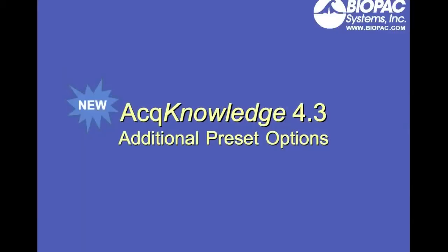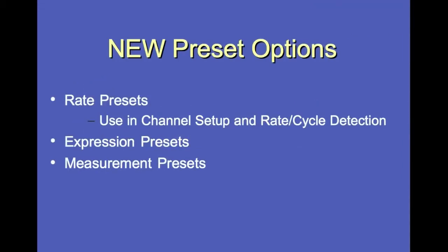Acknowledge version 4.3 has new additional preset options. The new preset options include presets for rates that can be used in channel setup and in rate cycle detection, expression presets, and measurement presets.